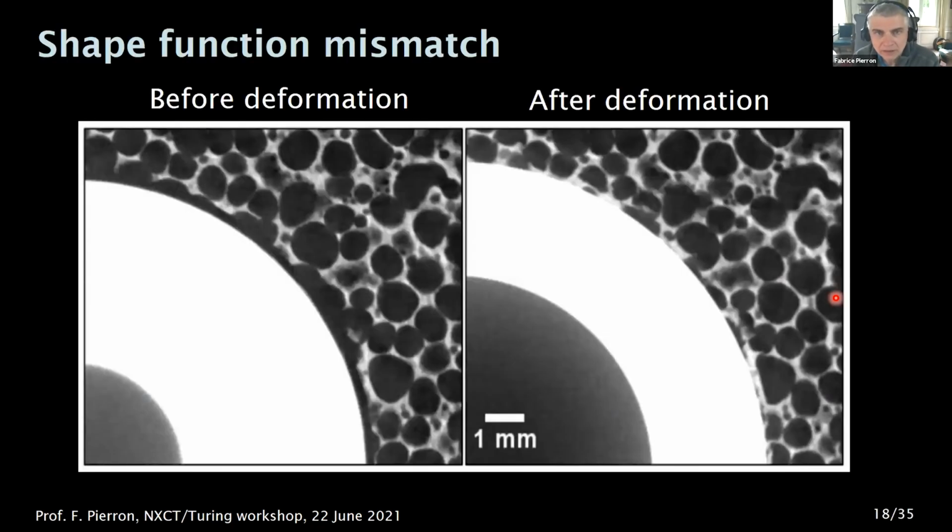So before and after deformation, this is what the material will look like. This is taken from Alex Marter's PhD. You can see the implant, the aluminium here, and the trabecular bone phantom here, which is a foam. And you see, you haven't got contact here between the pusher and the material. And then after contact is made by pushing the pusher in, you can see that you have a local deformation of the foam close to the pusher.